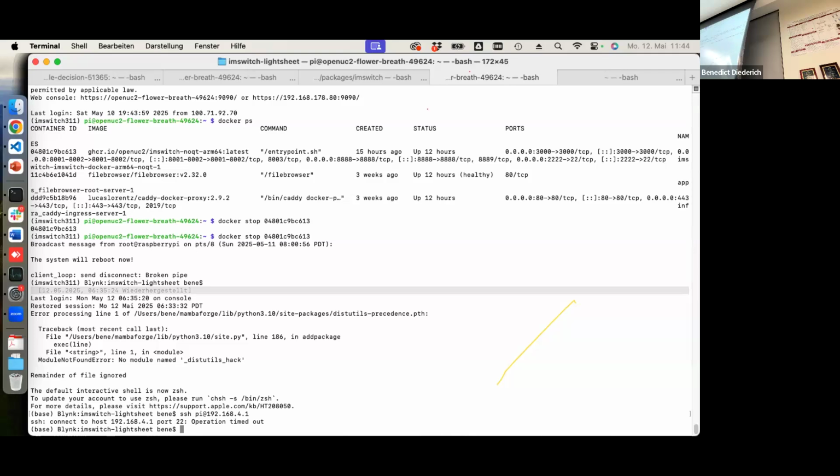And can you change that within a single mirror, or do you swap out mirrors to get different cutoffs? There are mirrors that have multi-band behavior, turning on and off at certain spectrum ranges. For example, here it's a greenish laser, so it would reflect the green, but it could of course have the slope shifted to the red.